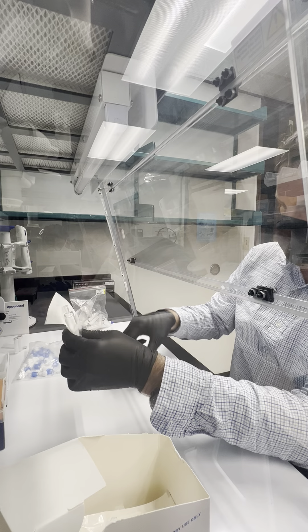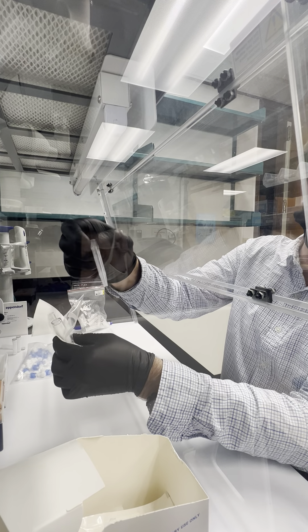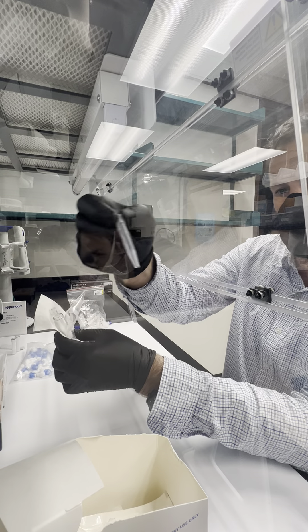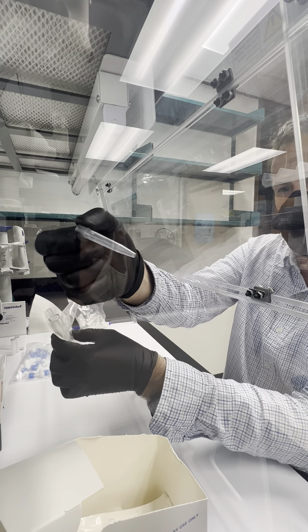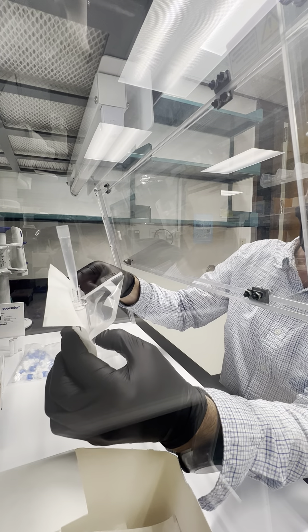We have a 1000 microliter pipette tip that we've cut the tip off so that it fits just into the top of the Sterevex, and that's going to serve as a funnel.